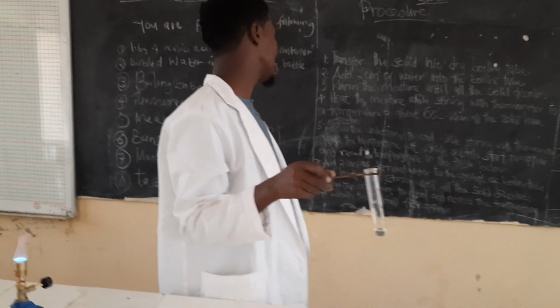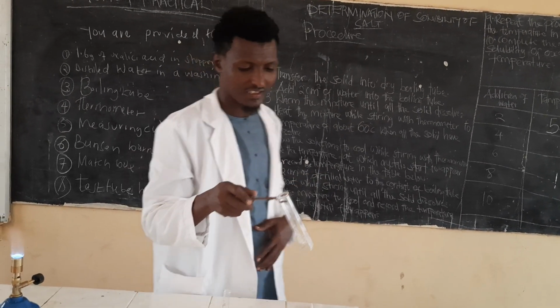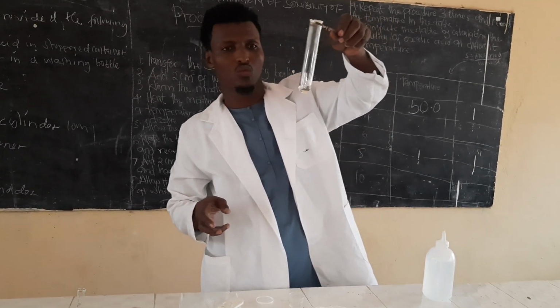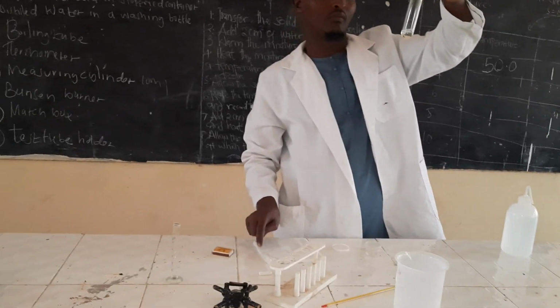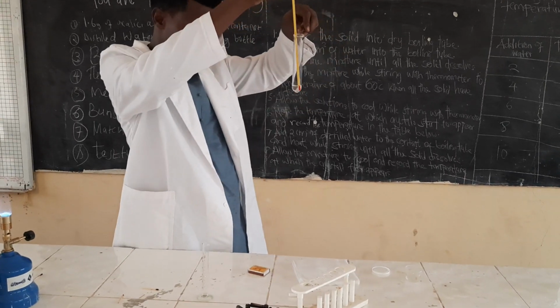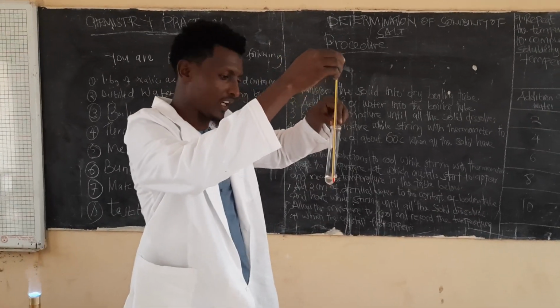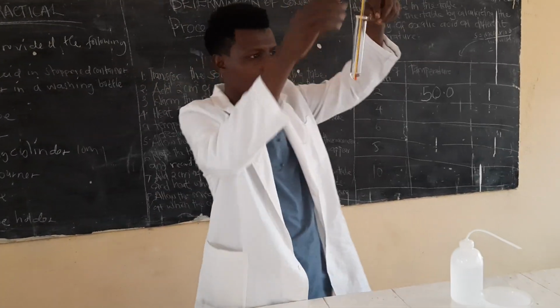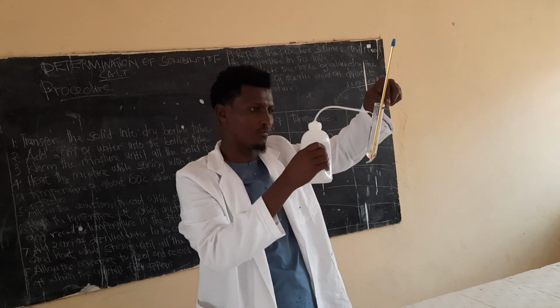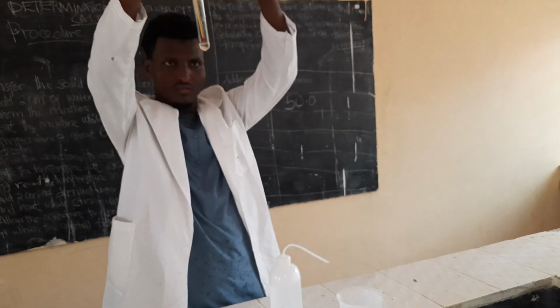Now, allow the mixture to cool and record the temperature at which the crystals first appear. As I told you, you can use cold water or put it in a water bath, then allow it to cool.